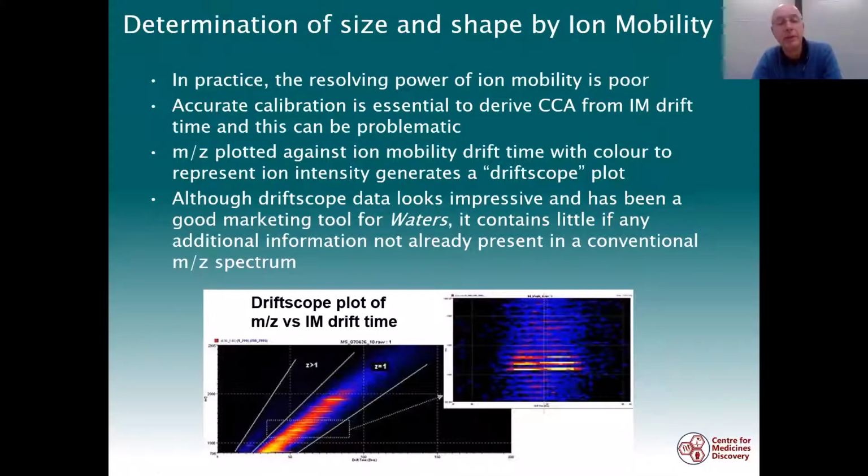It looks totally different, and it looks like you're getting lots of information here. Well, there is lots of information on there, but that information doesn't really add very much to what you would already get from the spectrum.